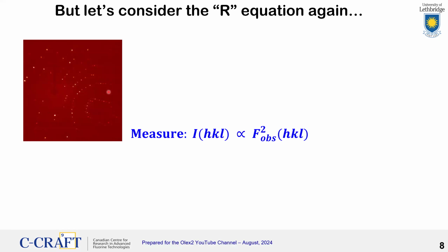In the X-ray diffraction experiment, we have a crystal which is mounted geometrically right about here, and it is impinged by an X-ray beam, a focused beam that is monochromatic, single wavelength, and then the electrons in the crystal scatter the X-rays to a very small extent, but intense enough that they can be detected.